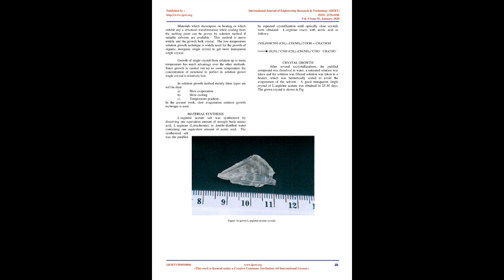3. Experimental technique. The solution growth is an alternative method of growth when the starting materials are unstable at high temperature. This is the simplest and oldest method of growing crystals, in which the material to be crystallized is dissolved in water or a suitable solvent to the desired degree of supersaturation. The solution is slowly evaporated. Using a seed crystal or without a seed crystal, excellent large quality crystals can be grown.